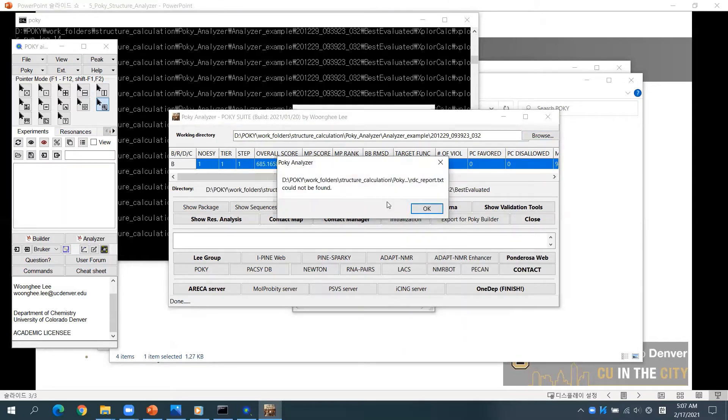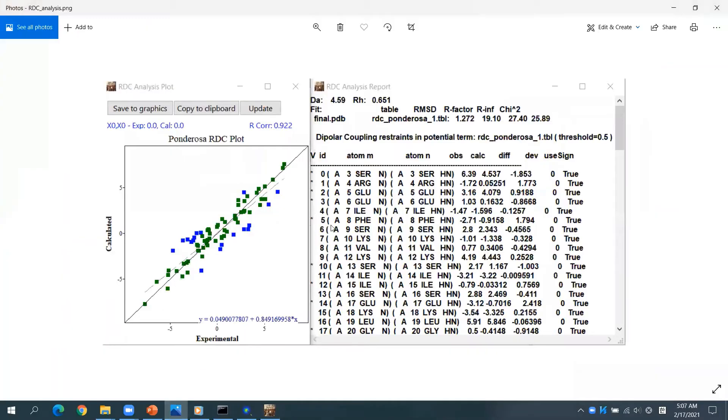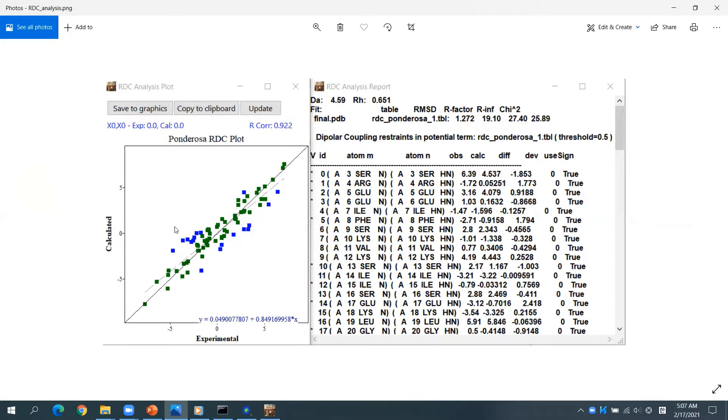As you can see here, you can only see the RDC result when you used RDC data in the calculation. If you did, you will see these two windows. Color changes from green to blue, violet, and red as the deviation increases. You may copy this chart by clicking Copy to clipboard.